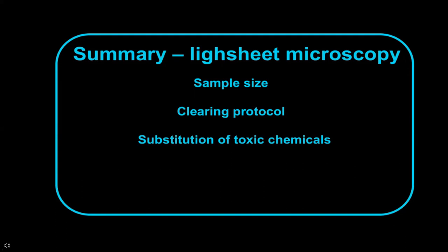Only few institutions will have their light sheet microscope placed with ample point suction. So here you can replace, for example, the DBE with ethyl cinnamate, so that you're not exposed to toxic chemicals while imaging.